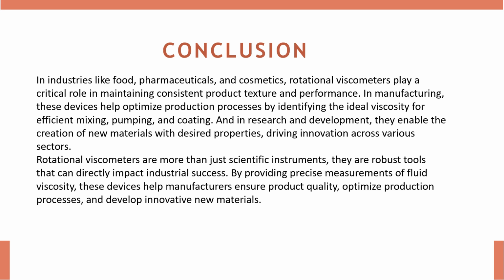So till now we discussed what is viscosity, what are viscometers and why we are studying them, and in detail about the rotational viscometers and their applications. From all this we can say that rotational viscometers are more than just scientific instruments. They are robust tools that can directly impact industrial success. By providing precise measurements of fluid viscosity, these devices help manufacturers ensure product quality, optimize production processes, and develop innovative new materials.